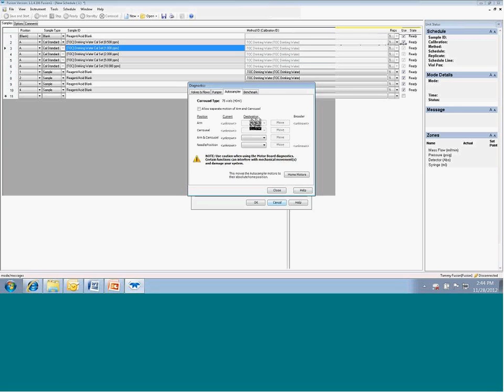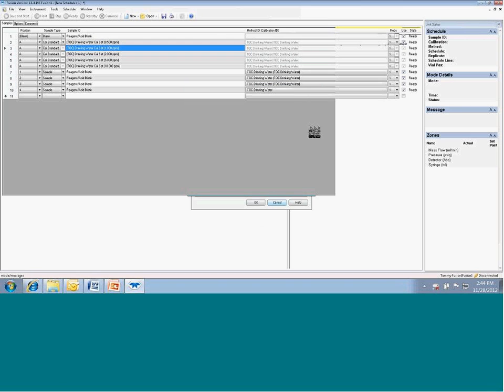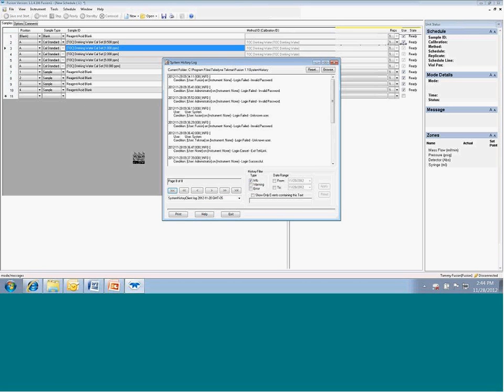You also have leak test or leak checking available with each of these. And because you have a mass flow controller in there, it validates the system. It takes the pressure of each of those samples, so you're able to pull that up in a system history log.